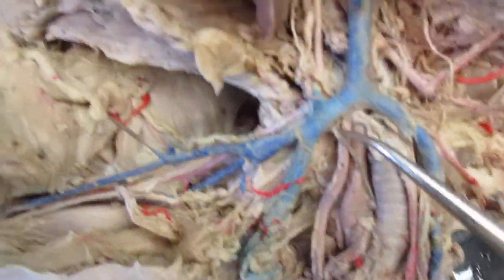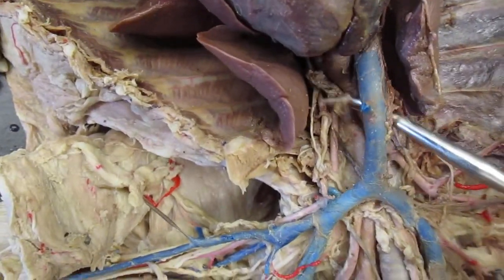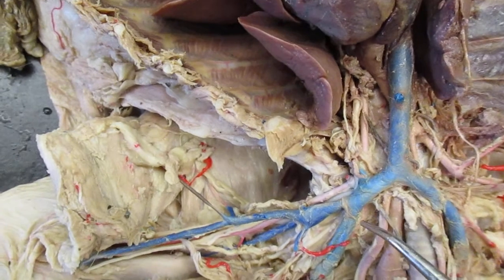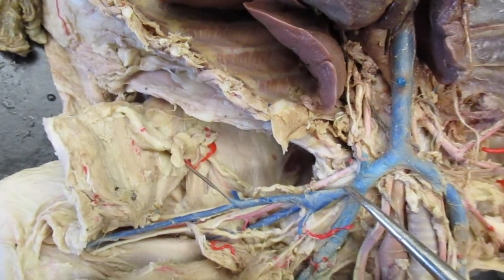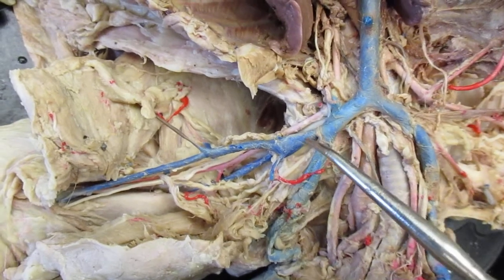So we have the superior vena cava. It's going to fork into your brachiocephalic veins here and here. And then you can see that it's going to fork again, subclavian vein, and then it's no good over there.